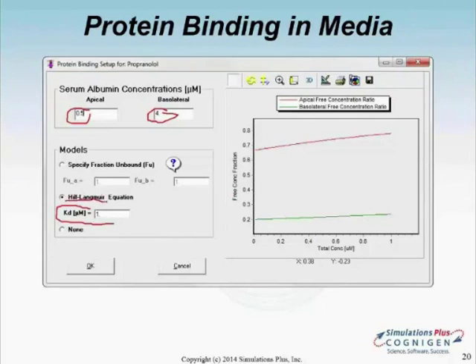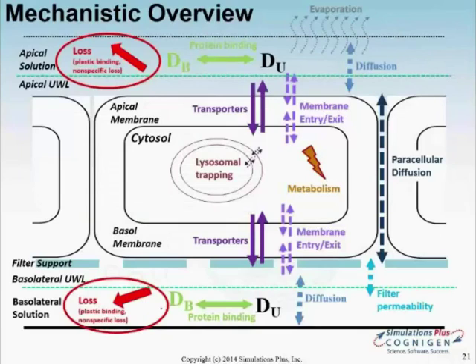And for that, we are using the standard Hill-Langmuir binding equation.